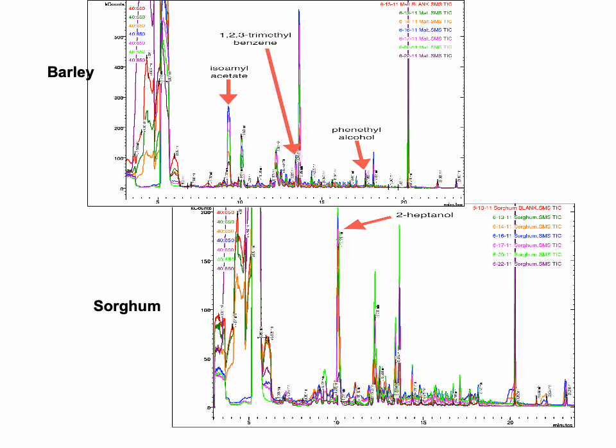Right? 2-heptanol is actually our standard. That's why we add it, so we can estimate concentrations of other things. It's not changing, which is on the bottom scale. But also, if we look just holistically at barley versus sorghum, those two pictures look different. Maybe not greatly different.